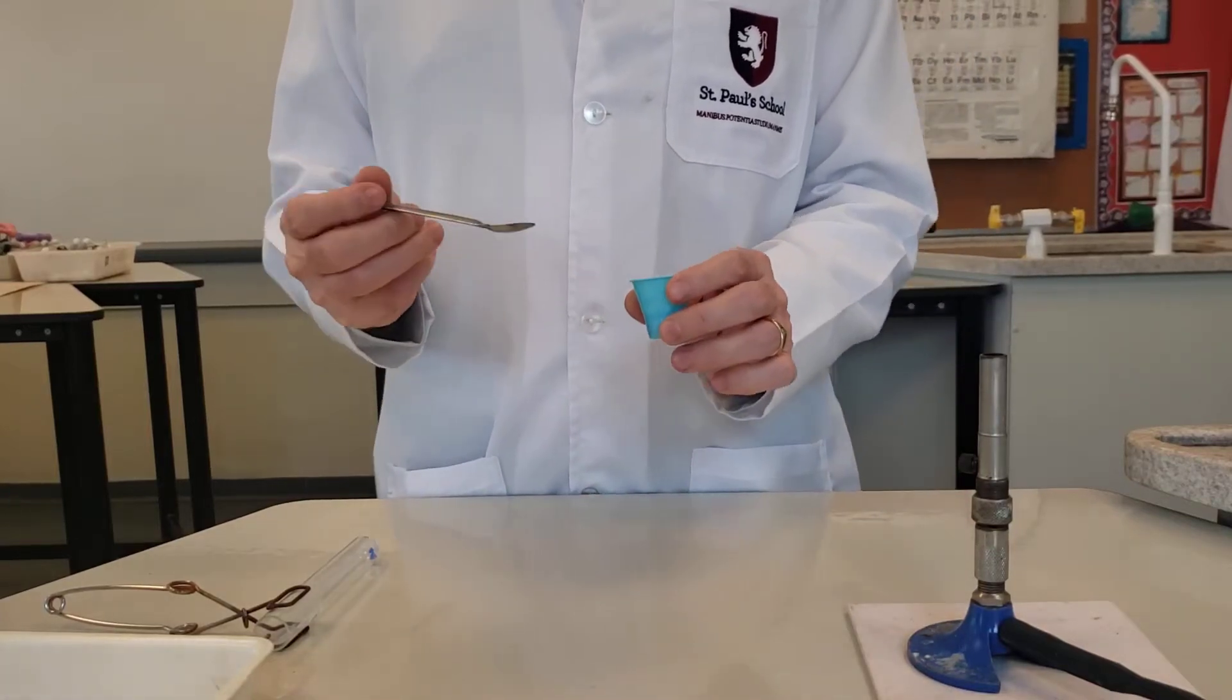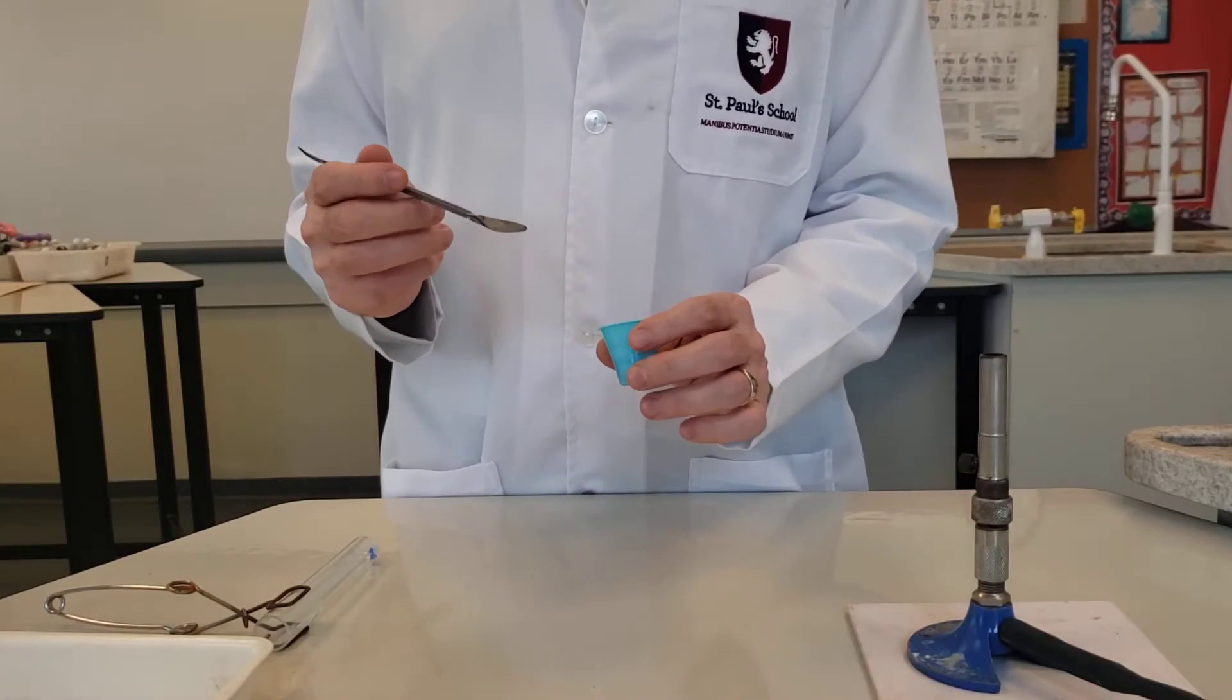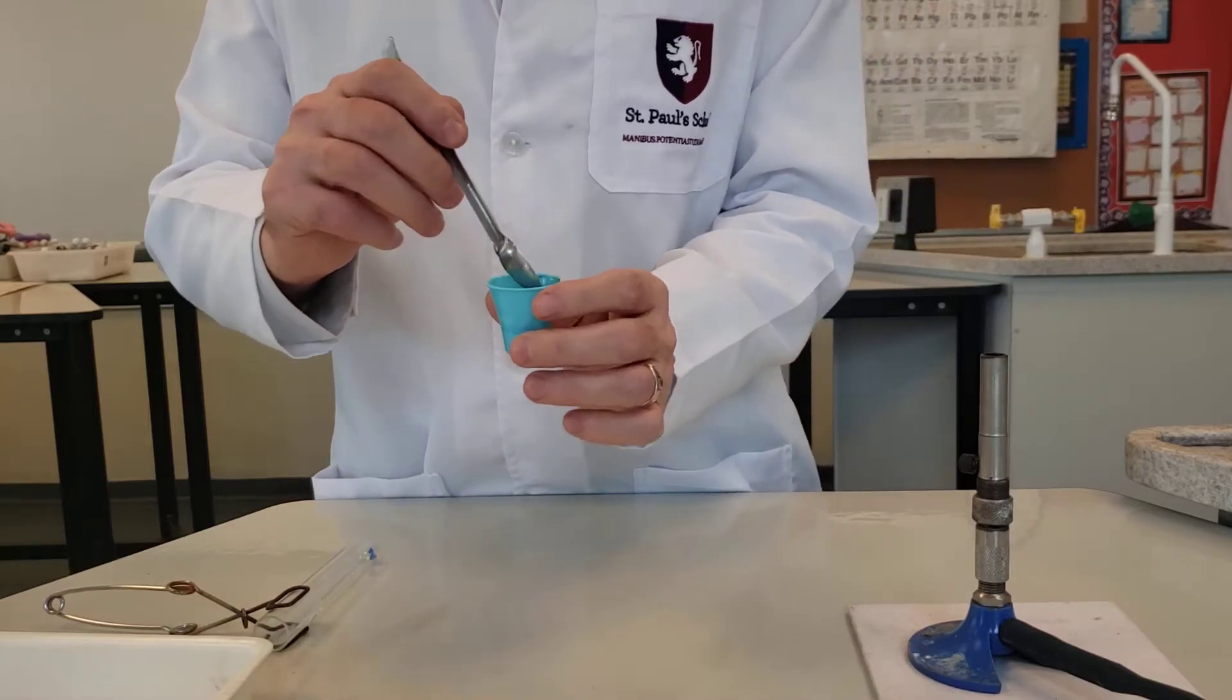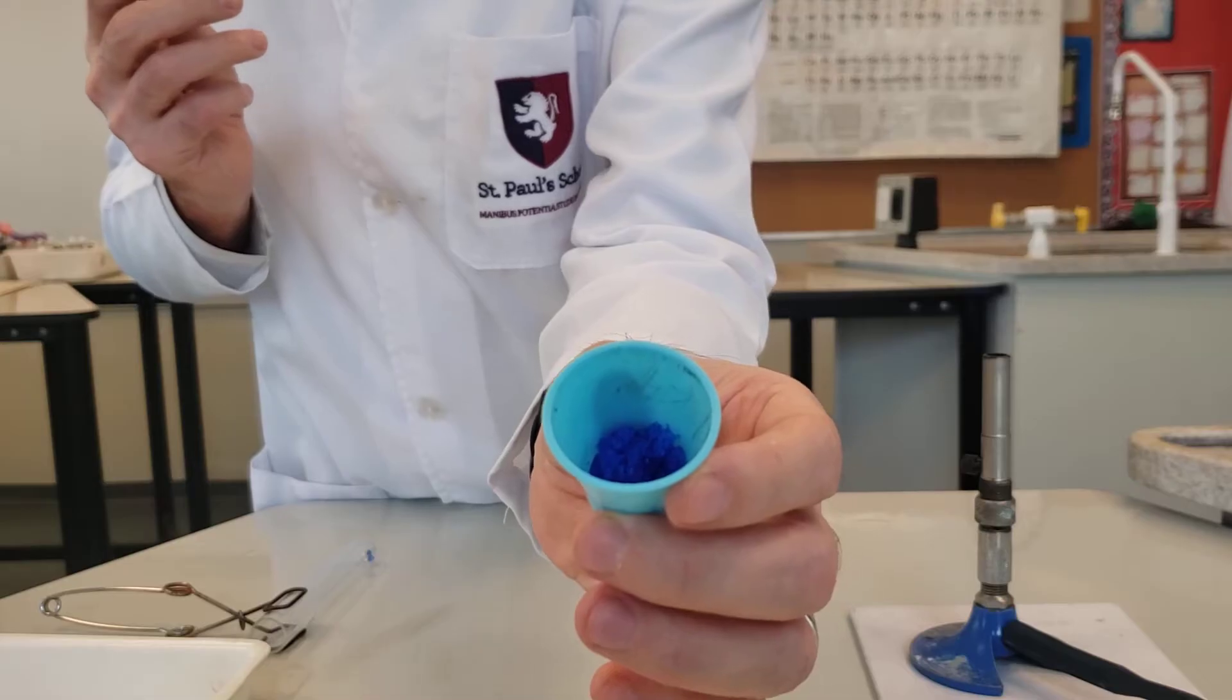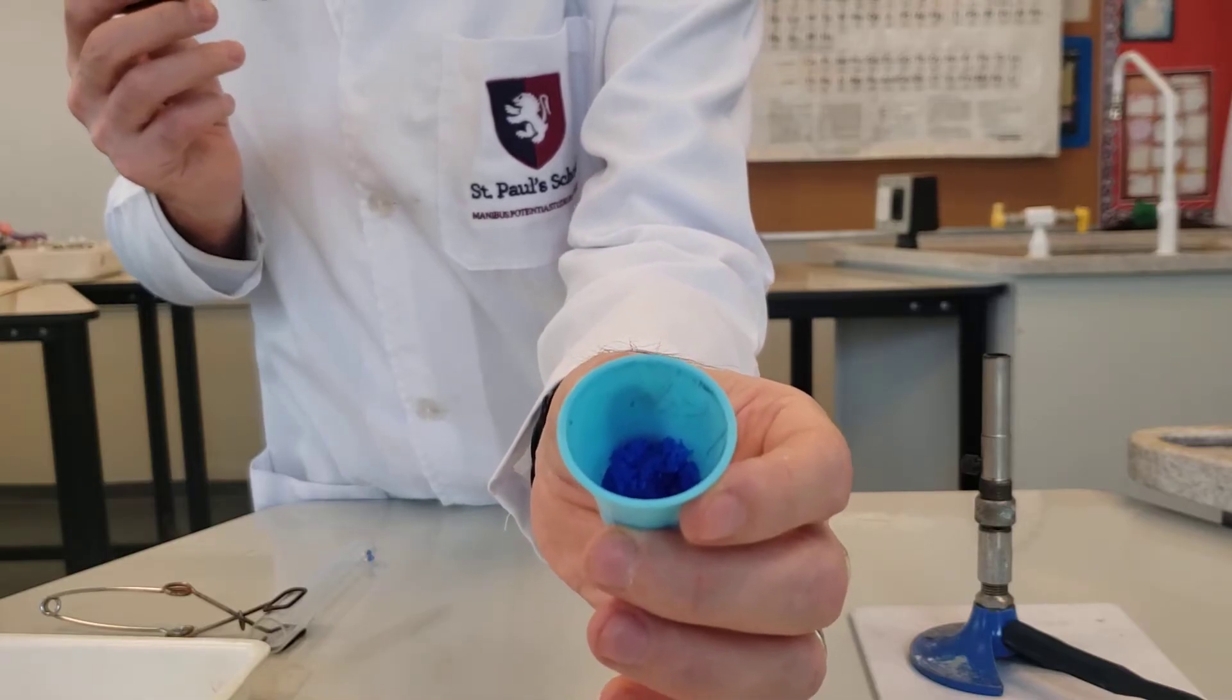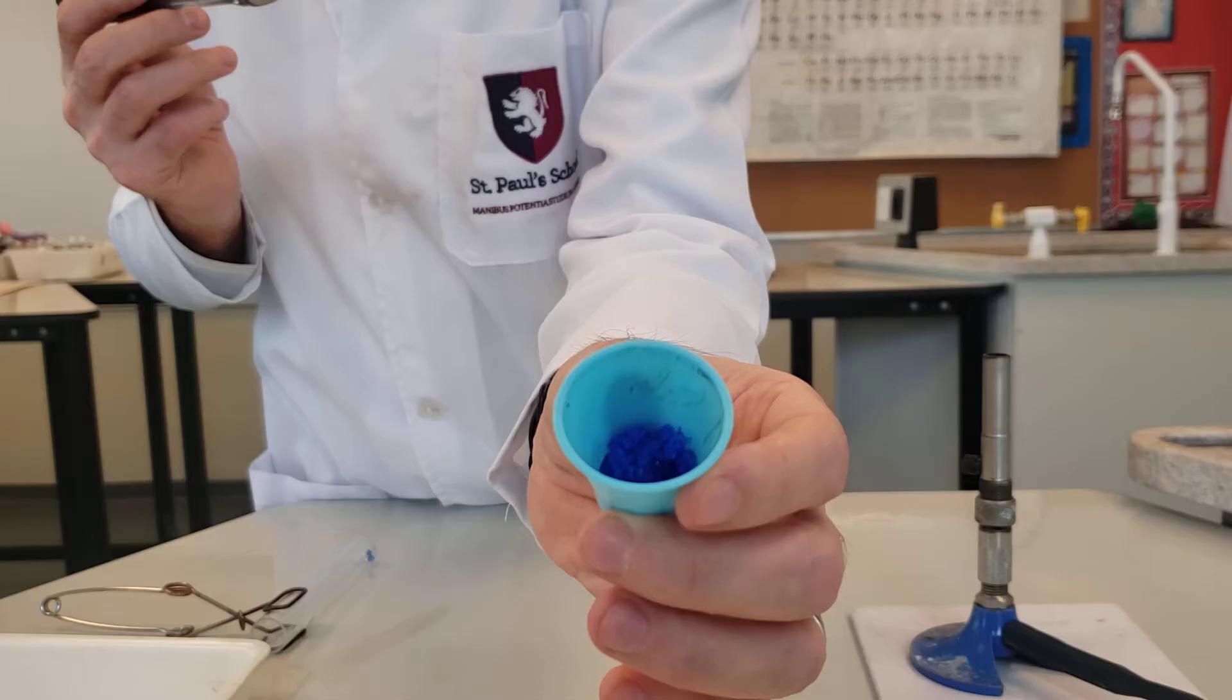Now I'm going to show the thermal decomposition of copper nitrate. You can see copper nitrate is a beautiful deep blue hydrated crystal, hydrated because there's quite a bit of water inside the crystal.